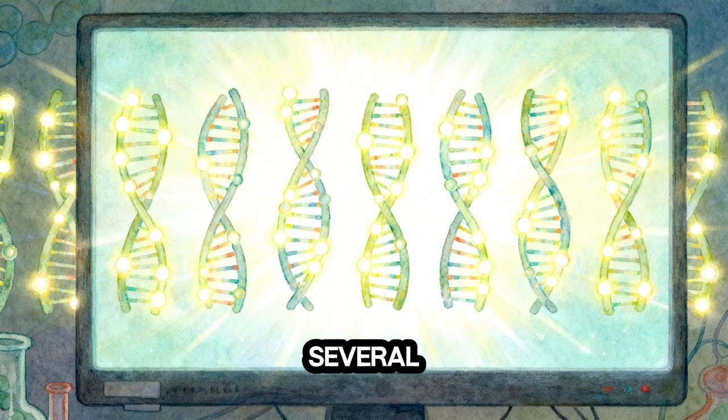If we repeat several different cycles, we can generate multiple fragments of DNA out of just one template.